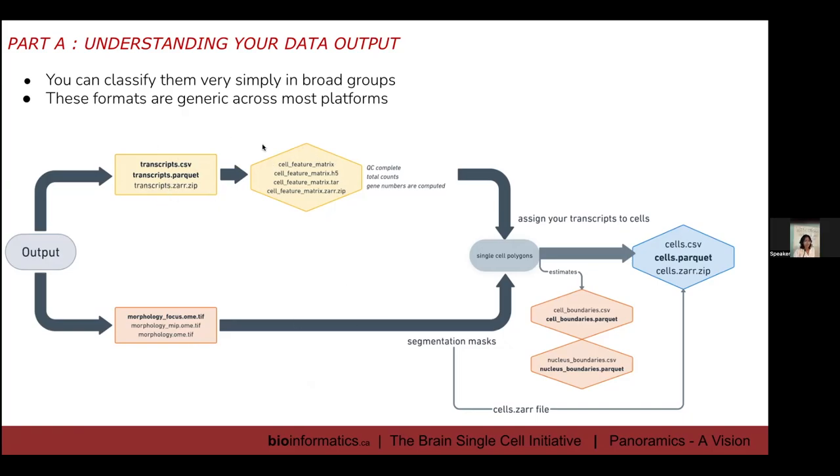I personally like to use and load the transcripts.parquet file. I like to load parquet files in general; they're faster, they're more memory efficient. But some segmentation methods, for example Baysor, use a CSV file.